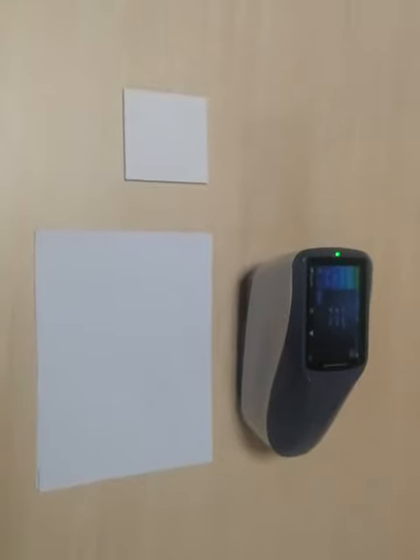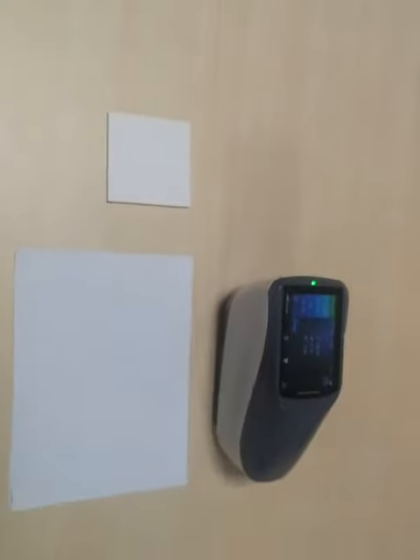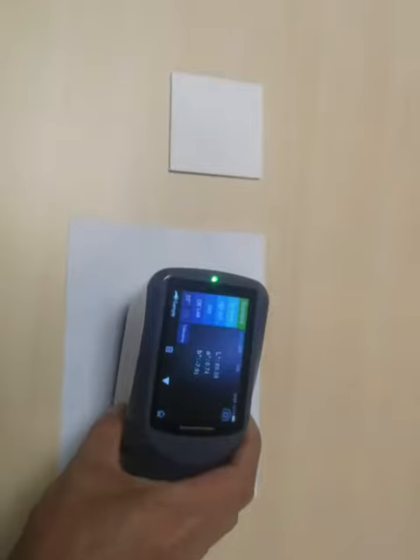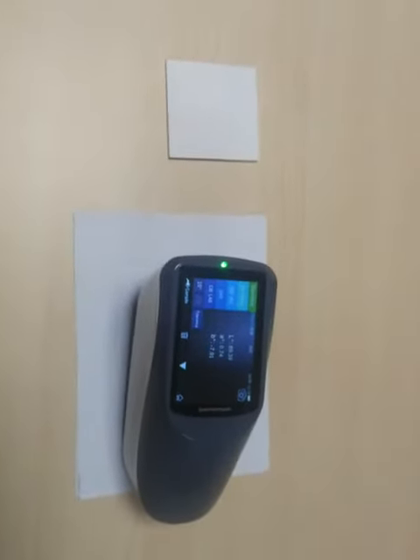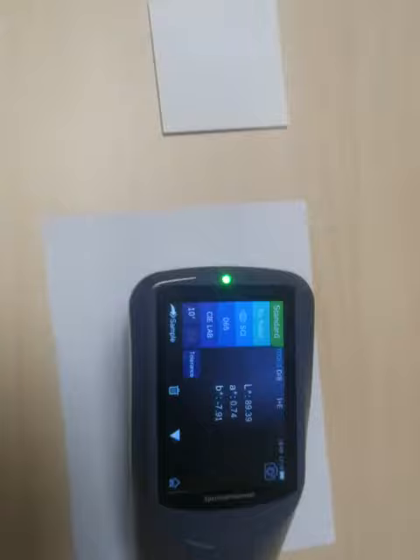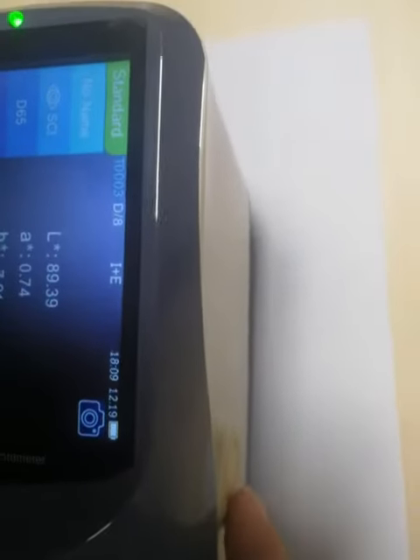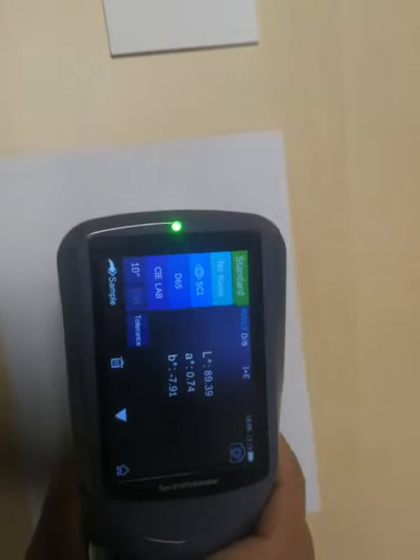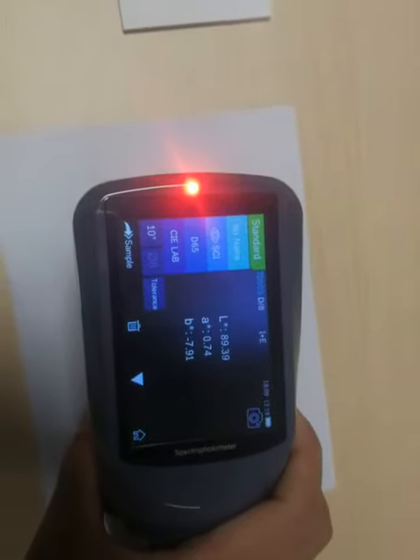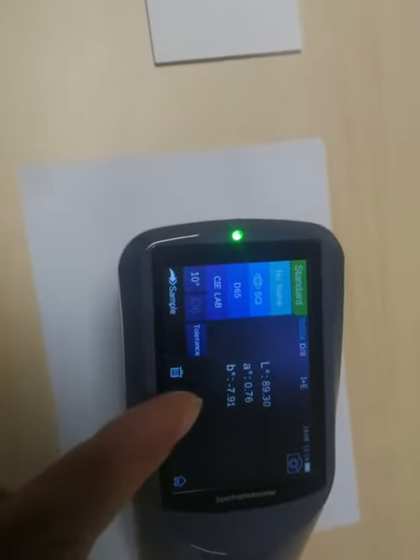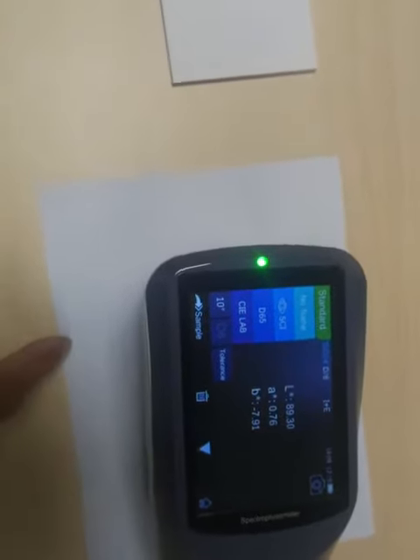I will show you by the spectrophotometer to see the difference of the color. First, we test the big paper and we set it as the standard. Here is the standard mode. This one is the testing button — we press it. This is the LAB value, which means the color of the big paper.